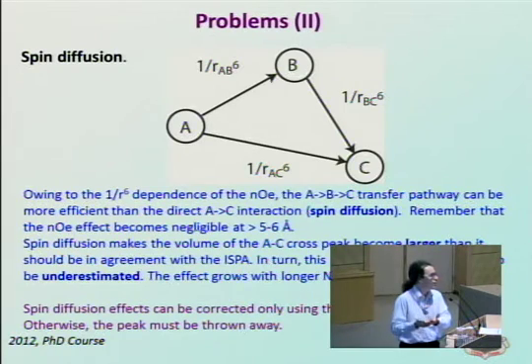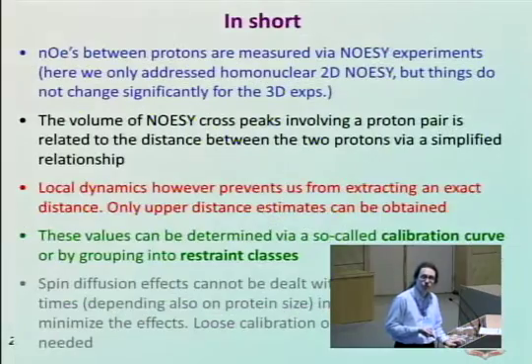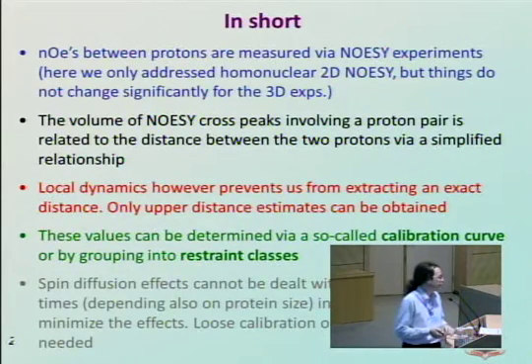If you actually go into the detail of how the calculation was run, you will see that these programs are consistently throwing away peaks just because they think they are pushing the atoms too close to one another. And this is something that people often neglect when automated things are run, but it can actually be used as a quality measure. So in short, just to recap, this is the longer part, okay, just because these are the most important restraints, the rest will be shorter.